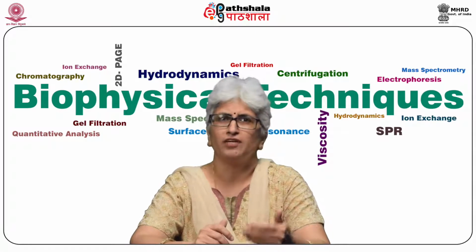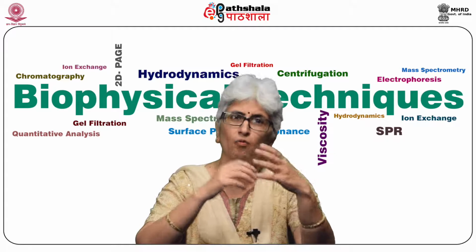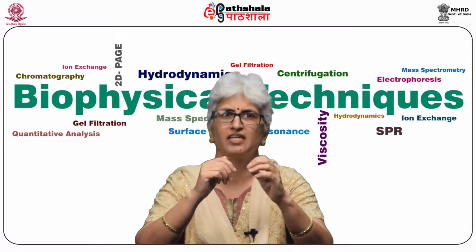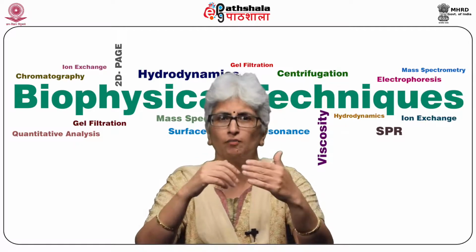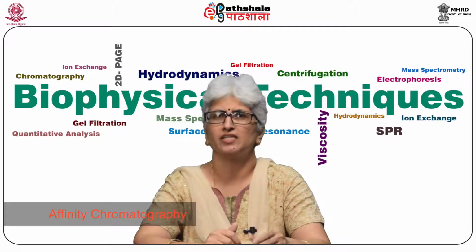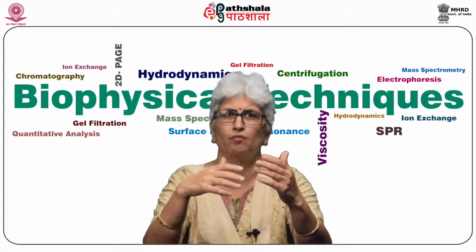The principle of affinity chromatography is solely based on the reversible interaction between the target molecule and affinity ligand immobilized on the column matrix. The suitable ligand selection is determined by the inherent recognition site present on the target molecule in such a way that the binding between target molecule and the ligand is very specific as well as reversible. Affinity chromatography process has three basic steps: sample loading, washing of non-specific molecules, and elution of target molecule.